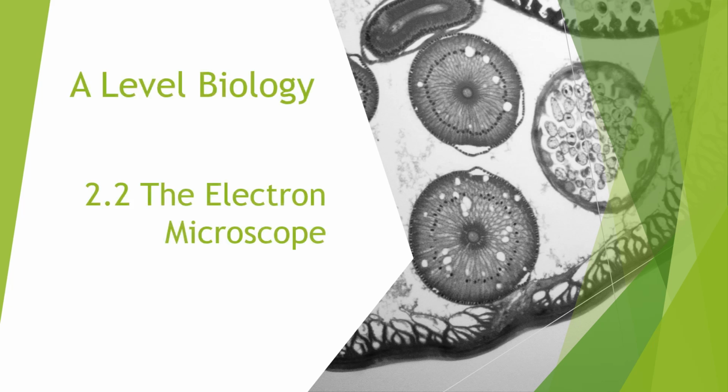Today we're going to be discussing the electron microscope, which is video 2 in chapter 2, cells, as part of our A-level biology course. So let's jump right in.